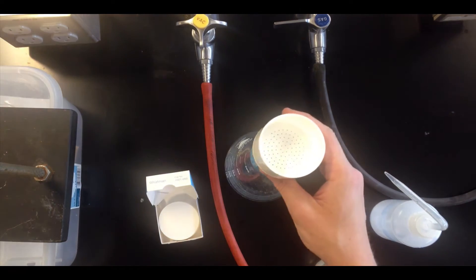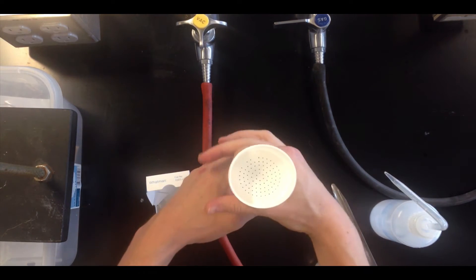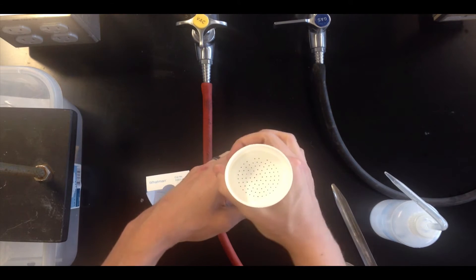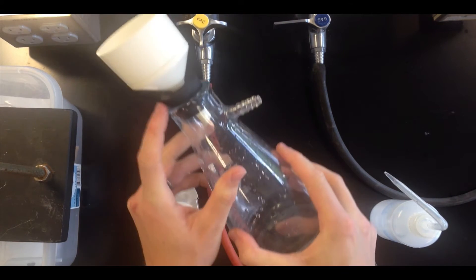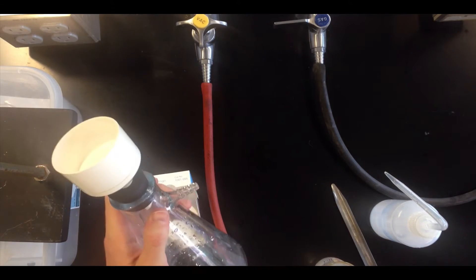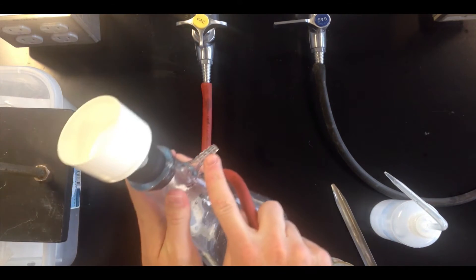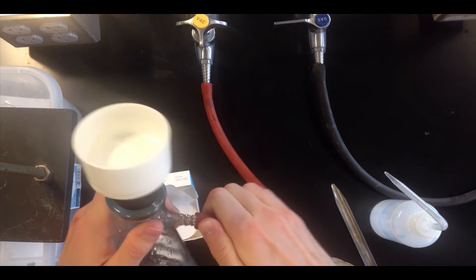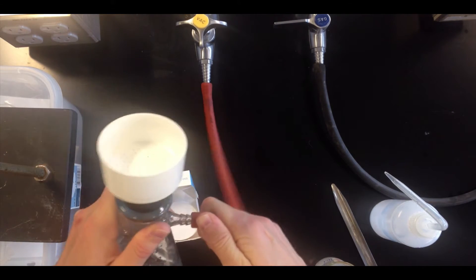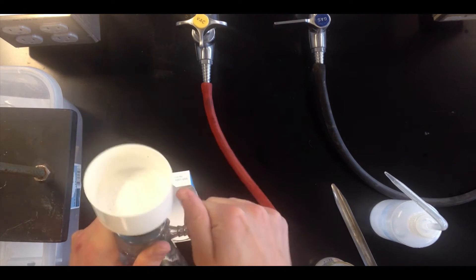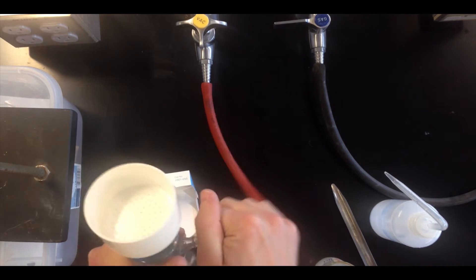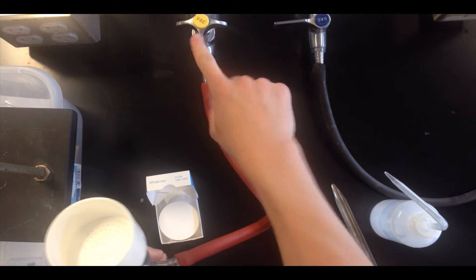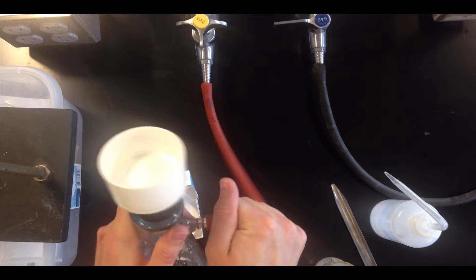To set up the apparatus, we simply plug in the Buechner funnel to the filter flask, making sure to get a good seal right here. We then connect the sidearm of the filter flask to the vacuum, and make sure to connect up to the vacuum tap, not the gas tap. The vacuum tap is the one with the yellow piece on top, and it says VAC, which makes it pretty clear that this is the vacuum tap.